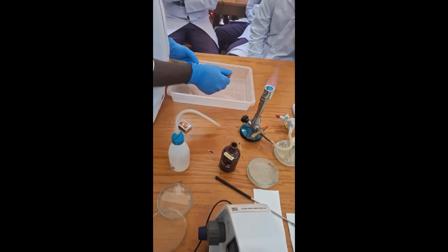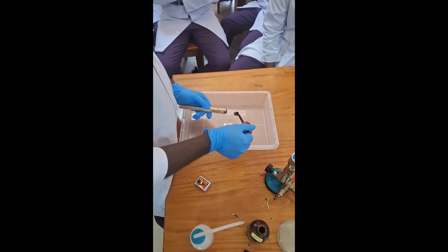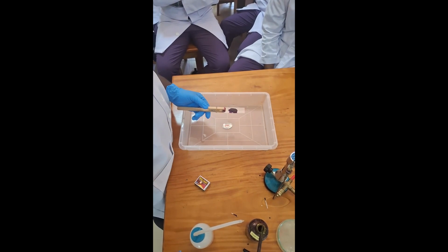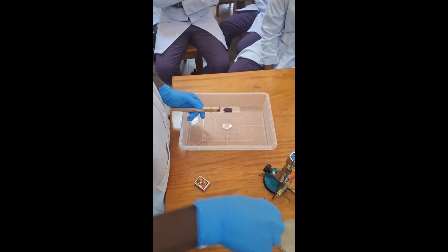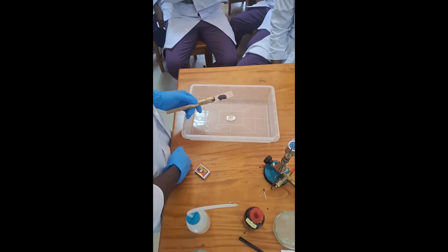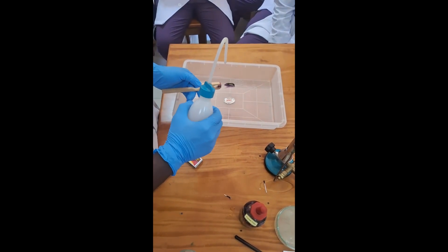Flood the smear with crystal violet and let it sit for 30 seconds. Crystal violet, a positively charged dye, penetrates the bacterial cell wall and cytoplasm and binds to negatively charged components, staining all bacteria purple. Rinse gently with tap water for 10 seconds.